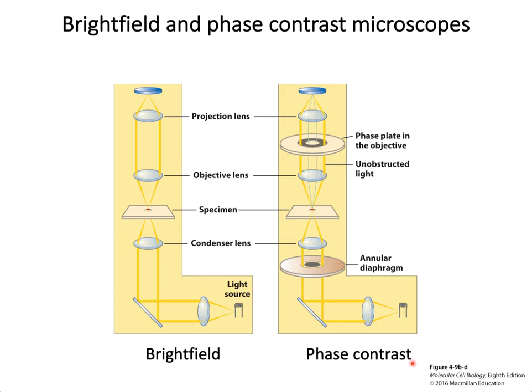One of the ways is to use different types of light microscope. Several different types have been invented, and it is the physics of the light microscopes that makes them differ from the standard light microscopes. I won't go into the physics of the various scopes, but will mention a few differences. In bright field microscopy, light from a tungsten lamp is focused on the specimen, usually stained with a dye to enhance the contrast, by a condenser lens below the stage.